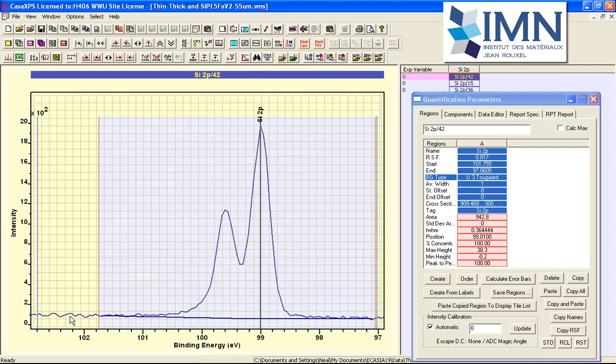oxide of silicon, or potentially this is the start of the scan, so this could be a settling of the instrument and some type of systematic error has accumulated here because of the long acquisition time.